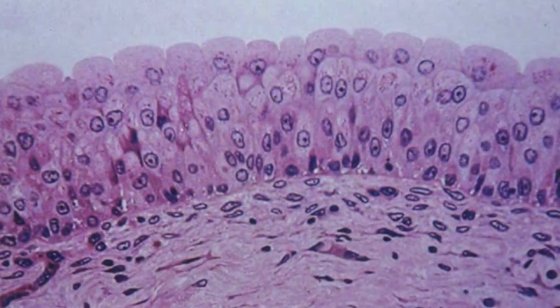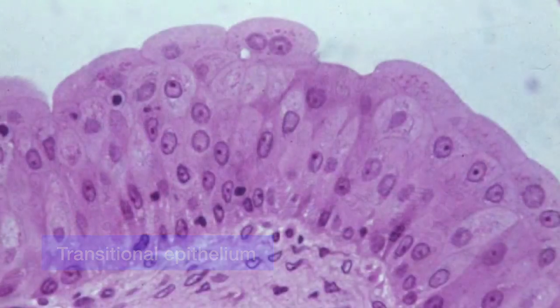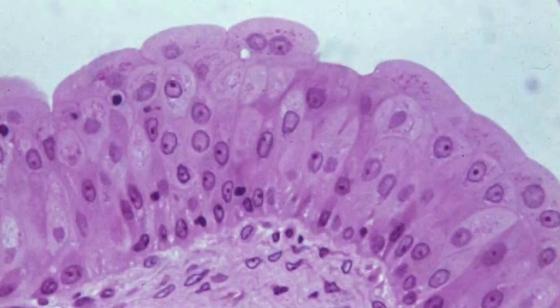The next one, transitional epithelium. It is a unique arrangement of differing cell shapes in a stratified or layered epithelial sheet. Variable appearance with flat apical cells in response to stretch, returning to a rounder appearance when pressure subsides. Transitional epithelium lines the urinary bladder and portions of the ureters and urethra and allows urinary organs to stretch and maintain a protective lining while holding variable amounts of fluid without rupturing.